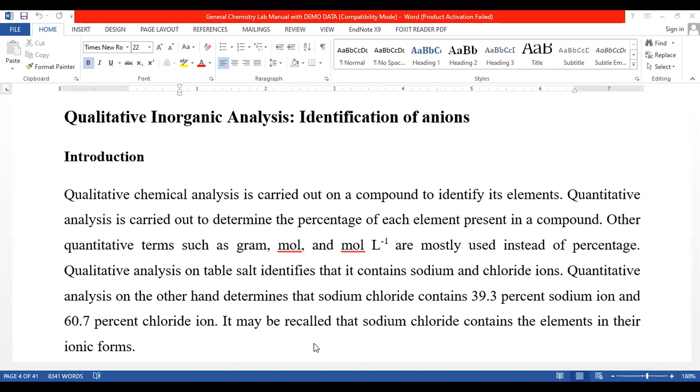So this technique is required to identify the total anion and cation present in an ionic compound. This technique is not very critical. It is very simple. Here we would like to make a solution of the compound containing the targeted ion, like sulfate ion or sulfite ion, phosphate or phosphide, carbonate or bicarbonate, chloride, bromide. All right. So this ion-containing compound we will dissolve in water. Here most of the solutions would be aqueous solutions. Aqueous solution means where water is used as a solvent.